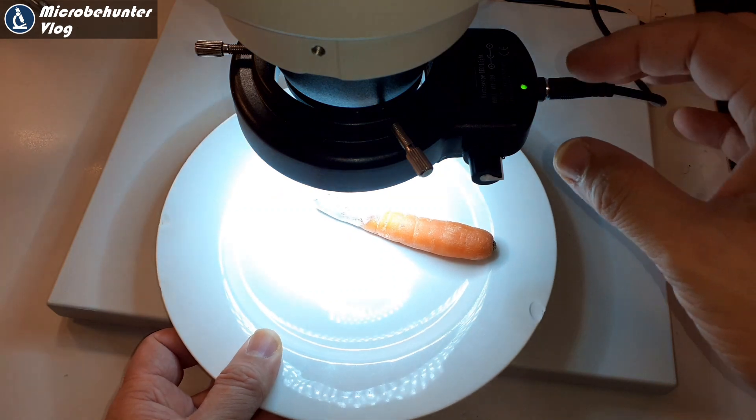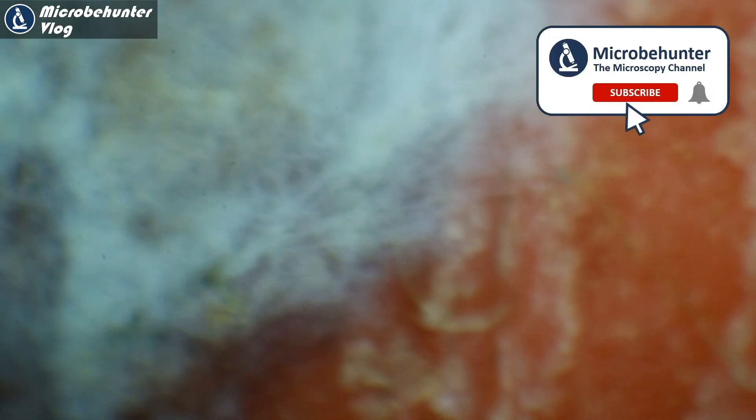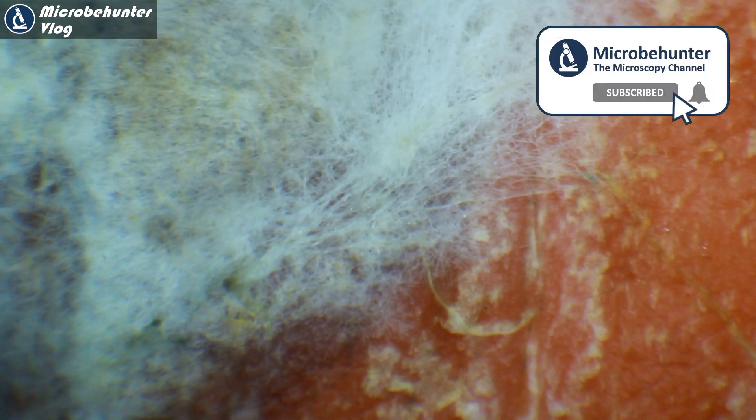First of all, every time when you handle mold, be careful because the spores can cause allergies and some people start to get asthmatic attacks when they inhale them. So be careful when you handle it. Under the stereo microscope you can see very well the fuzzy nature of the so-called mycelium.